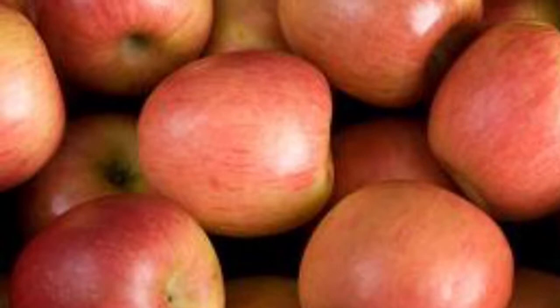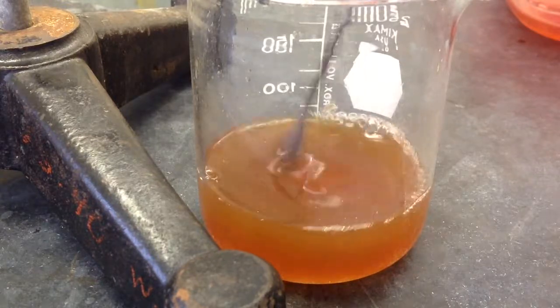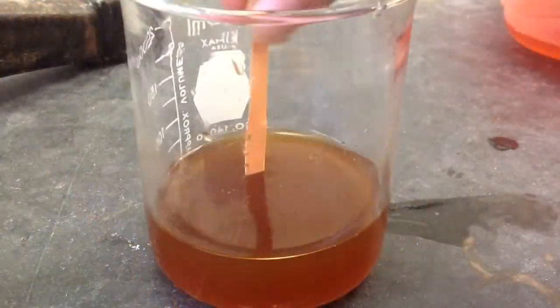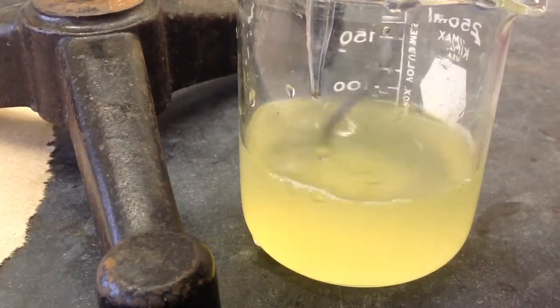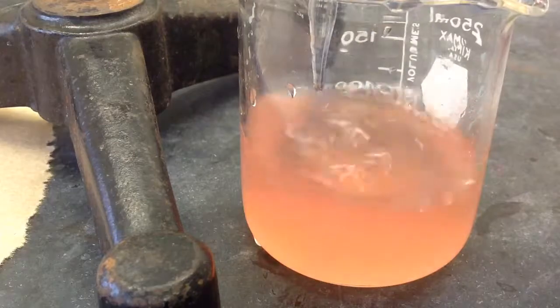My first test was with apple juice. It took 2.5 milliliters of NaOH to reach the equivalence point of about 8.5. This test proved that apple juice was the least acidic out of the three juices. My second test was with lemon juice. It took 22.7 milliliters of NaOH to reach the equivalence point, much more than apple juice. The pH then read to about 9 using the pH strip.